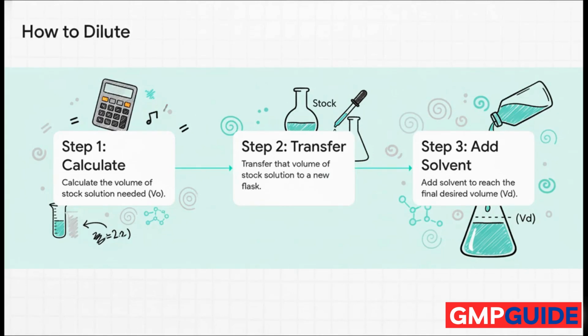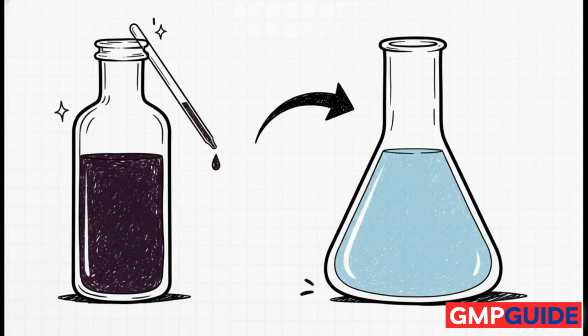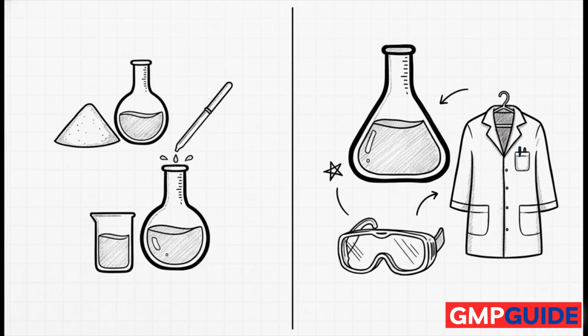It's just 3 easy steps. Calculate what you need, transfer it, and then dilute it. Simple. So for this ammonia solution, you only need 1.7 milliliters of the strong stuff. A little goes a long way. Knowing how is just half of it.